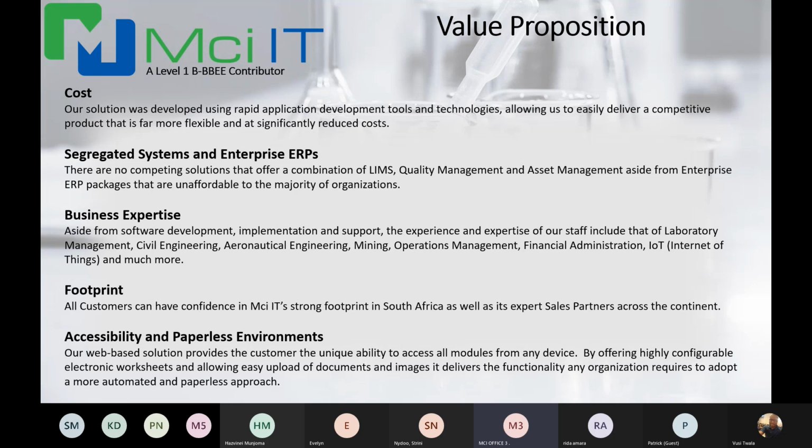Maybe just to add on the quality management module as well: any organization's quality manual has to grow, and all organizations want to go digital or paperless. So you have to have a flexible system. You want something that can easily be changed and grow with the organization. Even your basic screen layouts cannot remain stagnant. It's going to become a problem.